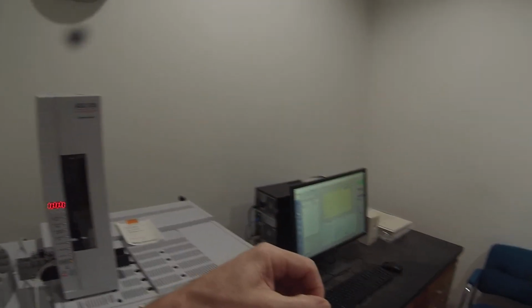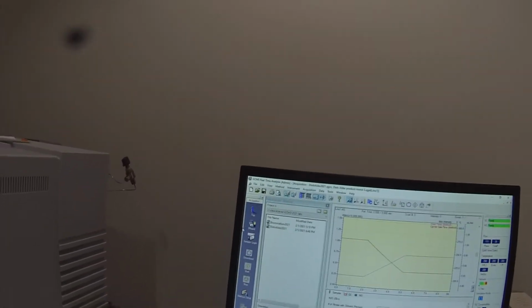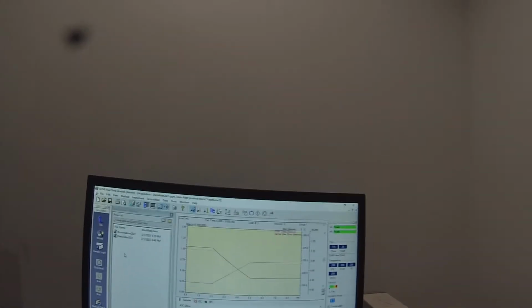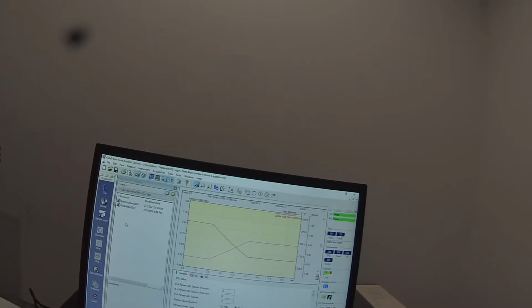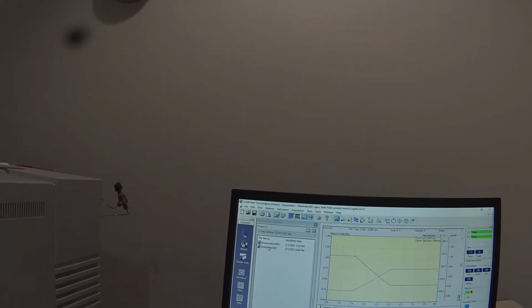So for our Aldol condensation product, which in my case is 57B, we're going to attempt to get some GCMS spec data on it. We'll also want IR data on that, which I've already obtained, and NMR data when the instrument works. So for a method file, it's not clear exactly what we're going to need for this material, but since it's pretty high molecular weight, I'm thinking that the same conditions for the Diels-Alder reaction might work.